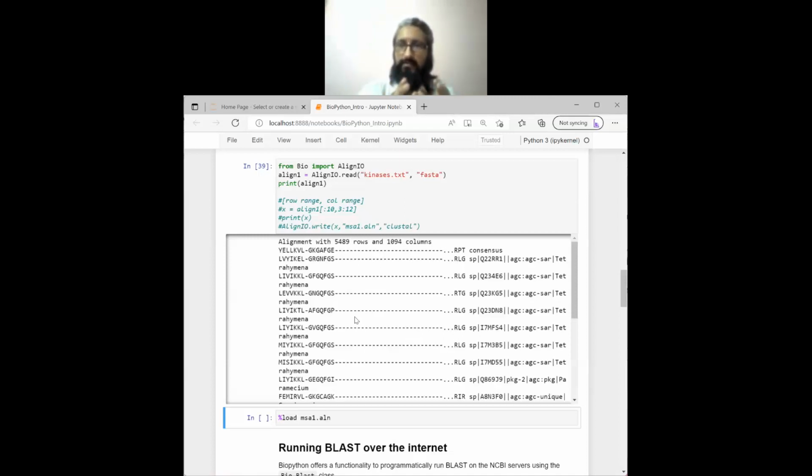You first align them, and once you have the output from that alignment program, then you can use it in AlignIO. Is it only going to tell us about the length of the sequences? No, a lot of many things. We'll go into why we are using AlignIO, and this part we'll cover in this one.